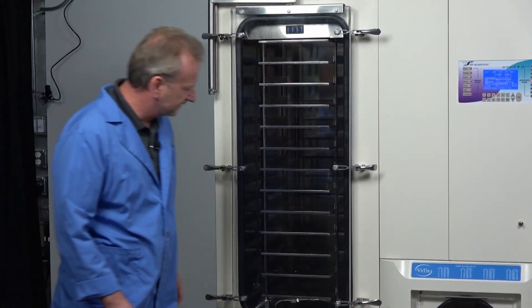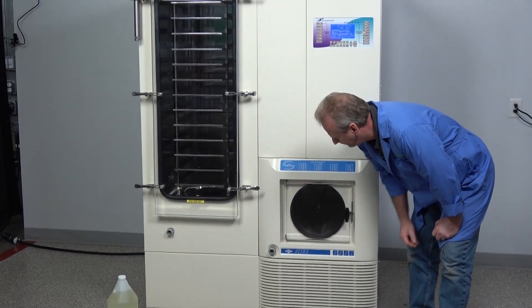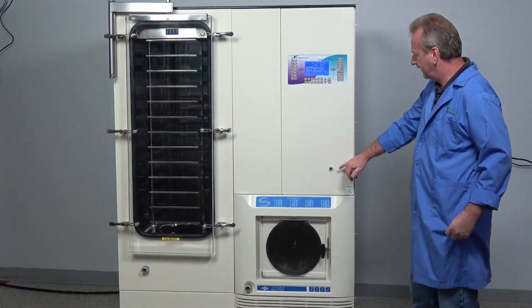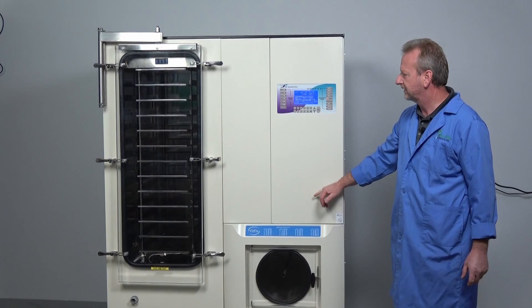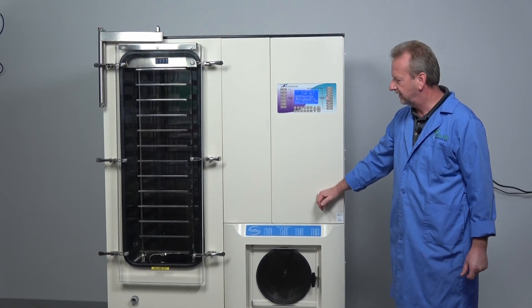Stepping over here — this is your standard drain valve there, that hasn't changed much. We did add an air intake here so that you can plug in nitrogen if you're wanting to purge back and refill your vacuum chambers.